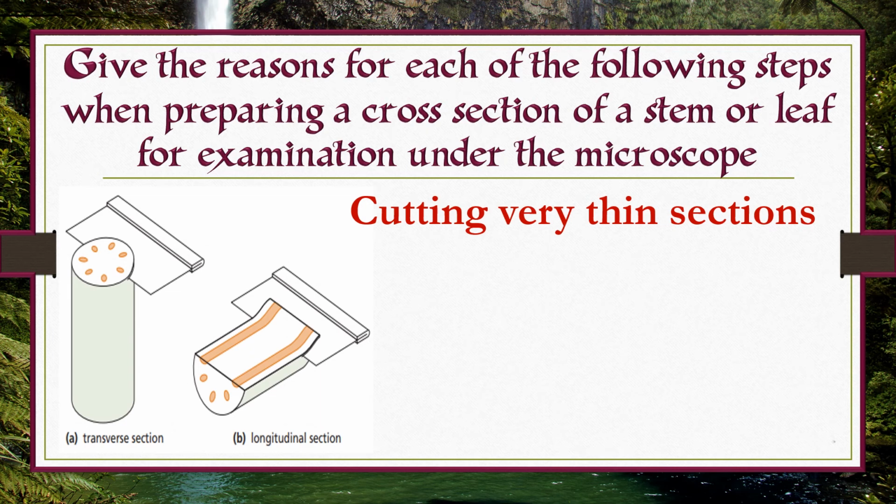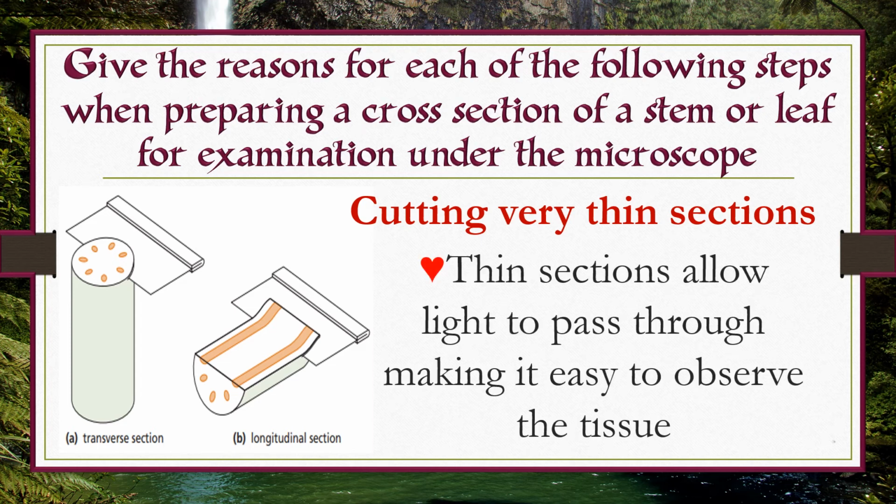Cutting very thin sections. Cutting thin sections allows light to pass through, making it easy to observe the tissue.